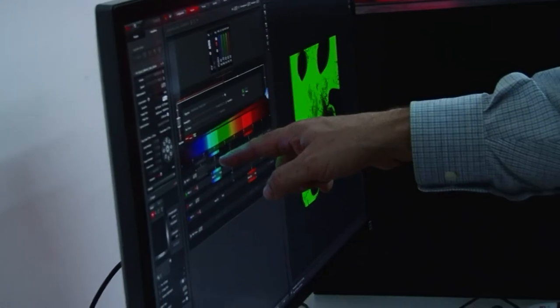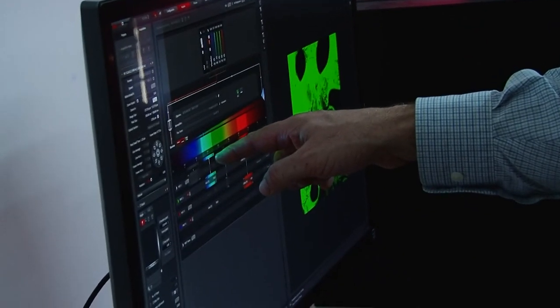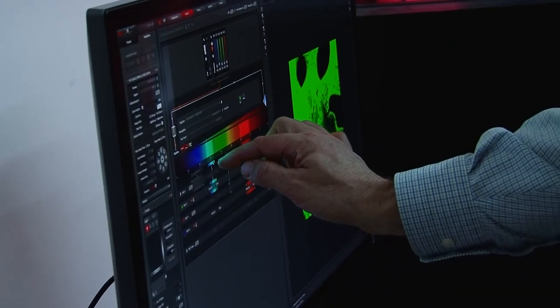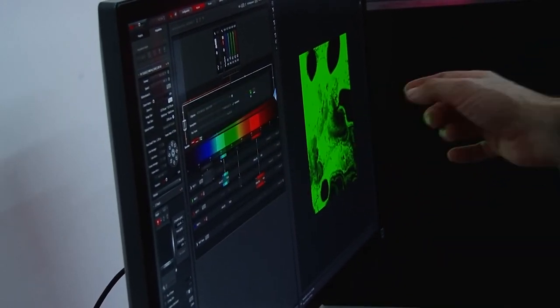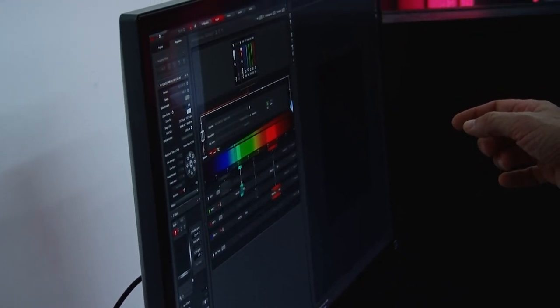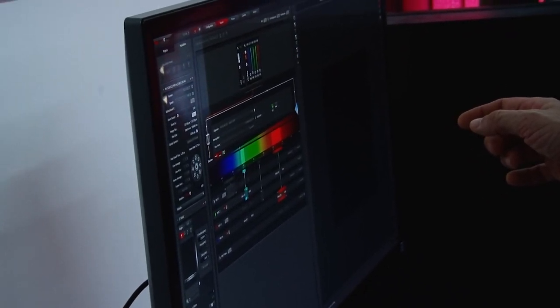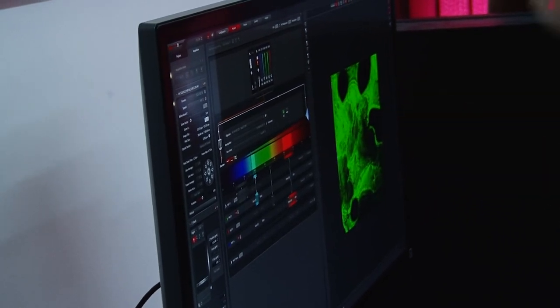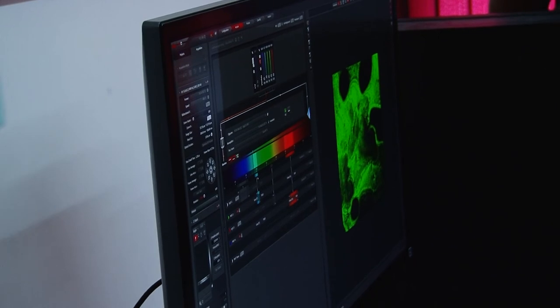And then what collector are you using? You using this one right here? Mm-hmm. So yeah, center this like around 512. Okay, can you make it narrower? Yeah. But bring it up around, like in there. Okay, and then, maybe over a little bit that way. Yeah, okay.